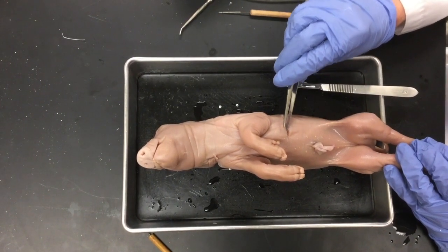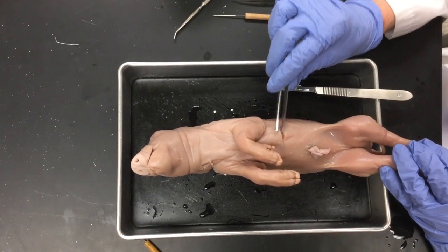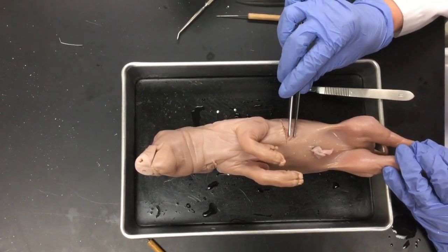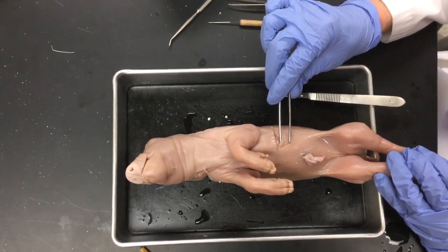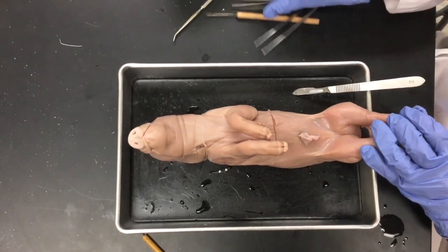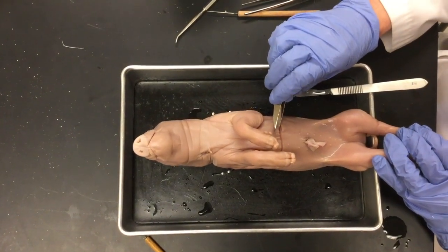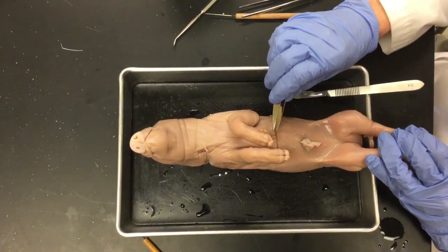This pig is quite developed, so it has a thicker skin. As I'm peeling back the layers and using the tweezers to move them side to side, I can see there's still some film there. Some of you with smaller pigs will not need to cut as much as I'm having to do with this particular pig.